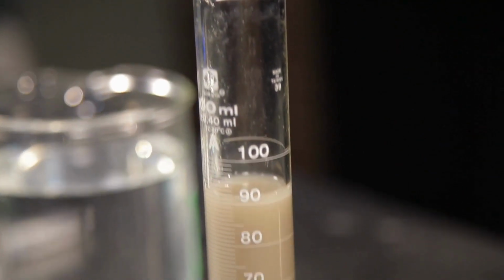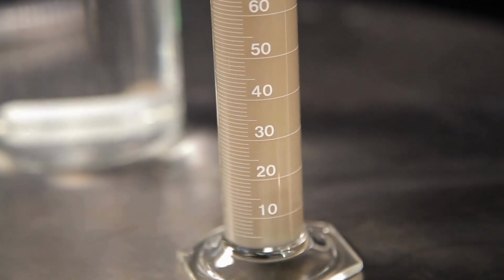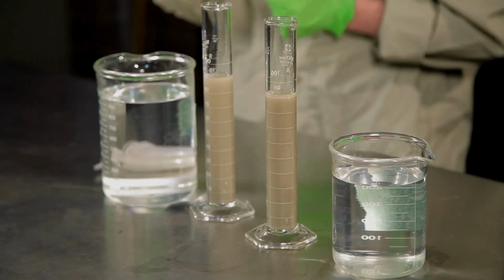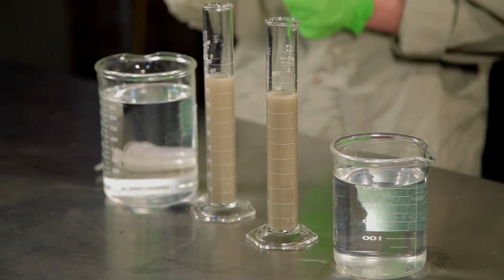As you see, the flocculant has little effect on the slurry sample. Typically, when the correct flocculant is added to a slurry, flocculation occurs and the particles come together to form large flocs which gain mass and settle to the bottom of the cylinder.